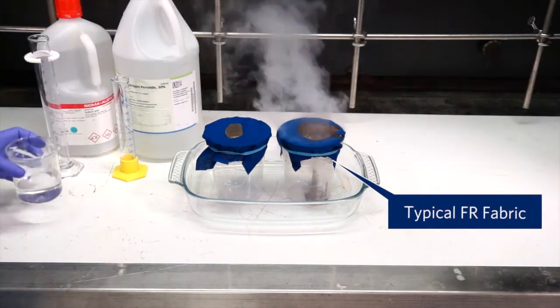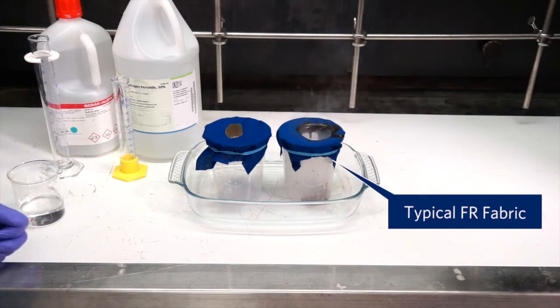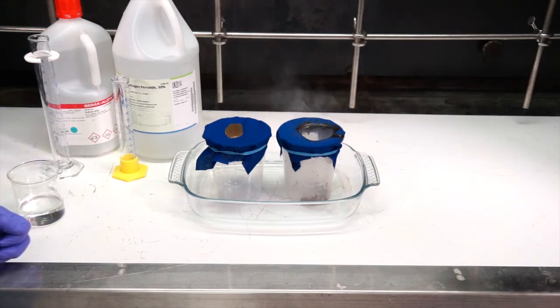When you pour this mixture on a fabric typically used in FR lab coats today, it eats right through, exposing the wearer to potentially severe injury.